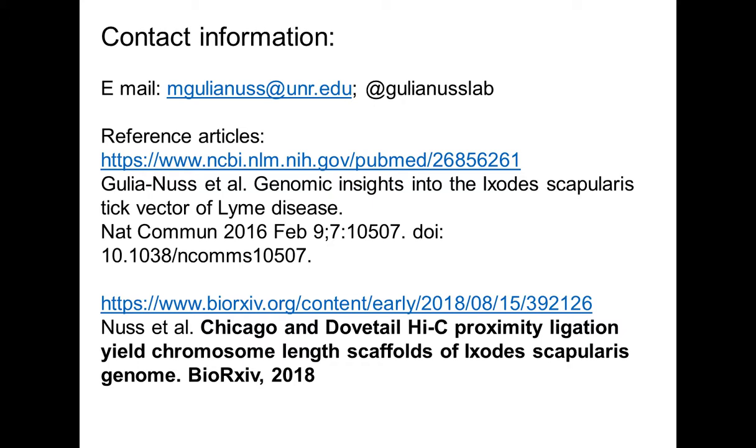Thank you. Next one is, how is Hi-Rise better than other scaffolding softwares? Okay, that's a great question. Hi-Rise is a proprietary software platform that was developed by Nick Putnam at Dovetail, and the input data types for Hi-Rise are either Chicago or Dovetail Hi-C data. There aren't that many scaffolding softwares out there. There are lots of de novo assemblers.